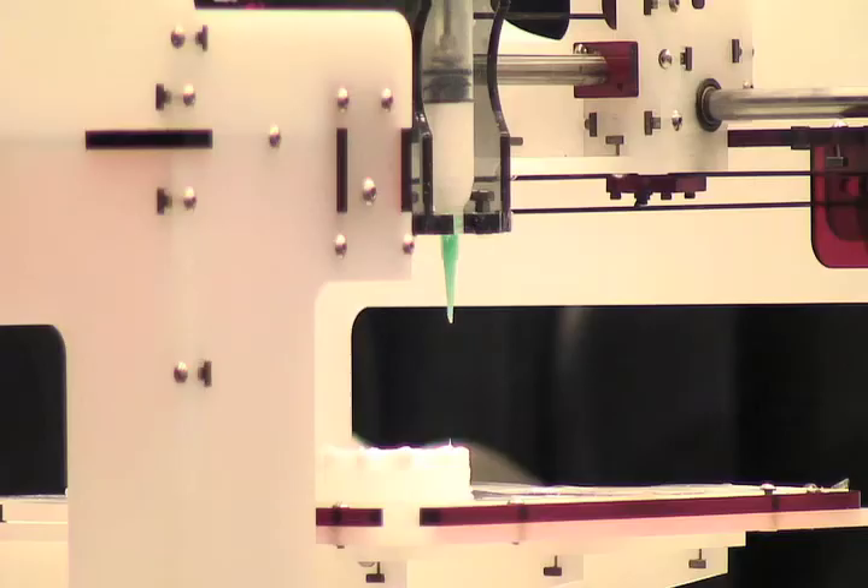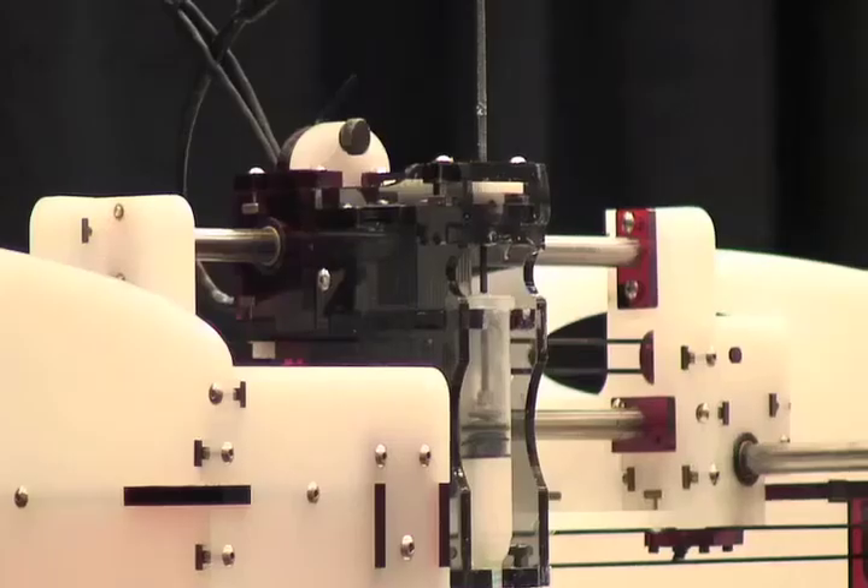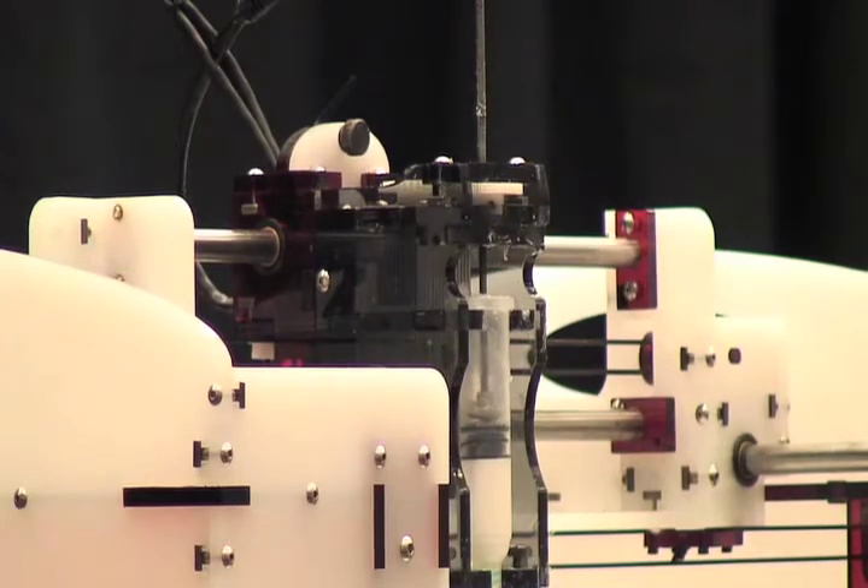We've been working on developing these printers for a while, and about two or three years ago we took our research platform and made it open source. This platform that you see here on the right is called the Fab@Home. It's an open source platform for 3D printing with multiple materials. While we initially were developing this platform for printing things that are inorganic, like robots and things like that, one of the biggest applications was to work on printing biological materials.